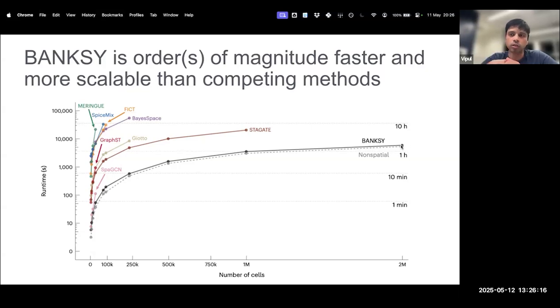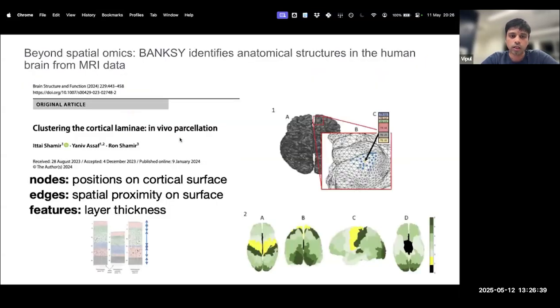And I think there's a tool called BP cells, which allows you to go up to 4 or 5 million cells. We've not implemented this, but we're looking into it. Just having BANKSY work with BP cells for the clustering step would easily make it scale to 5, 10 million cells. So this is nice as well.